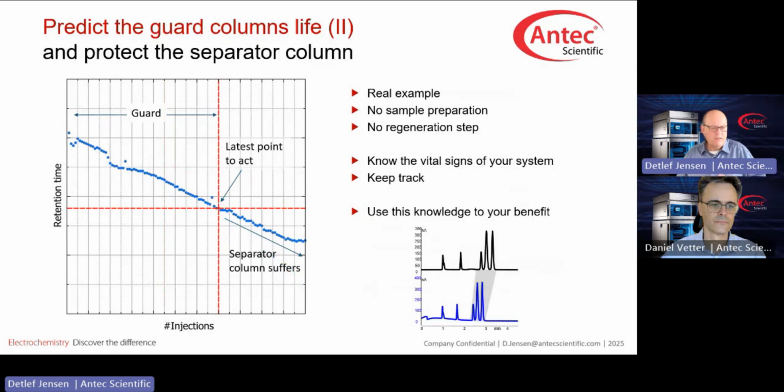Let's have a look at real data. So this is from an experiment that we ran in our house, and every single dot represents one sequence. And you do see that we have a continuous decrease in the retention time, and you do see the red crosshair in the plot. That is the latest point when to act. So when to do something with the guard column, to rinse or to exchange.